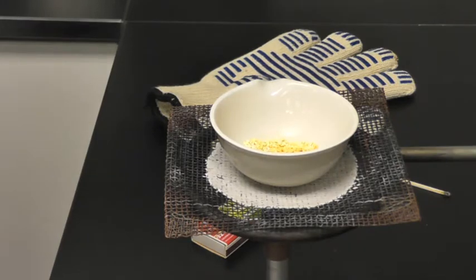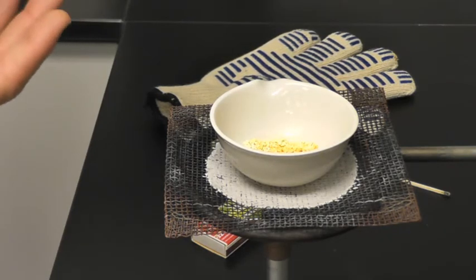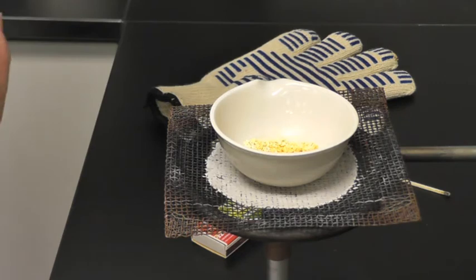And what will happen is we'll take it off, weigh it, come back, heat it again, take it off, and weigh it. So typically if there's any time we're ever getting water out of a substance, we'll heat it and weigh it twice. And if our weights are close to each other, it means we got all the water out the first time. Because water is impossible to see, and it's such small molecules. You might think you have it out, and you weigh it, and you bring it back and heat it again and weigh it, and if its weight drops a lot, it means you didn't get all the water out the first time.